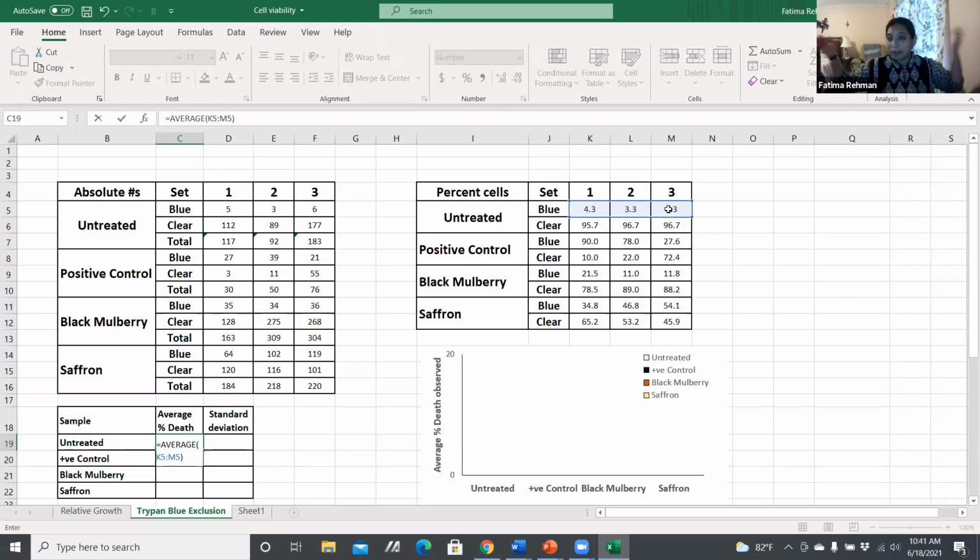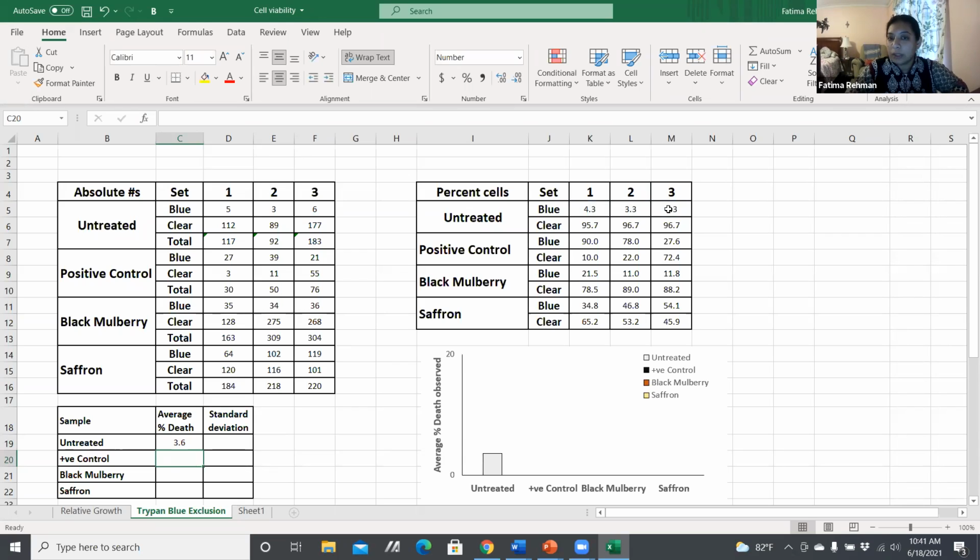And then I'm going to just select my three numbers. Again, could be 3, could be 1,000, doesn't matter. You select those numbers and click, and you will get them. I'm going to do that for the remaining ones as well. And again, first, actually, let me do the standard deviation as well.